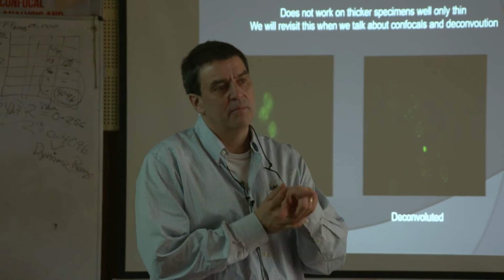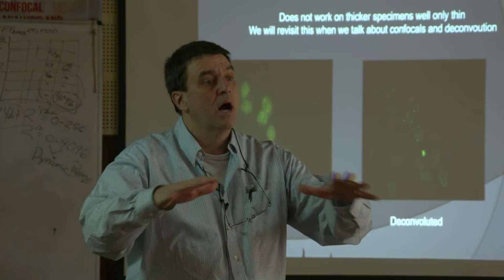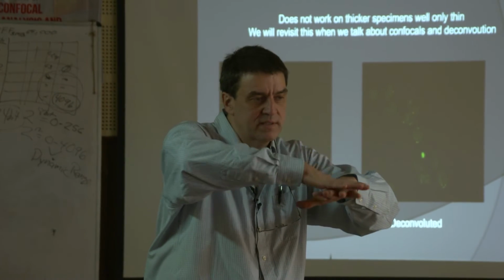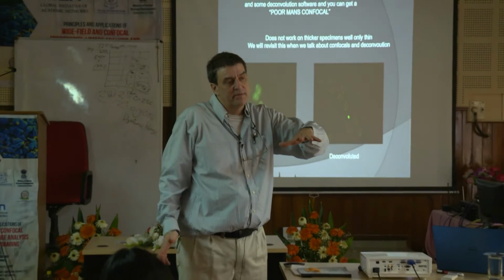So when we get into antibodies and things like that, I'll talk to you a little bit more about how to block, especially antibodies where I see the worst background, how to block non-specific binding of fluorescently tagged antibodies, because that's usually the biggest background problem.